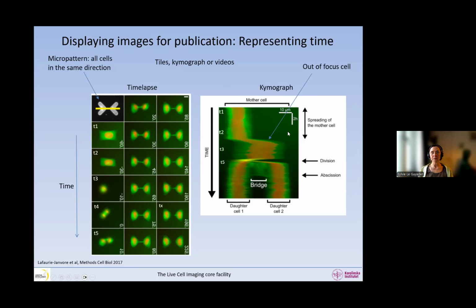And so we have lots and lots of images. We put them next to each other. And so in this dimension, it is time. And here it is X, the X dimension of the image. And so that works. And here you can see that the cell becomes a bit out of focus, because it's moving a lot when we go into this very fast phase in here. And then quite quickly, you can see here that we have a bridge that is being formed, and then we have two cells. So this kymograph is a nice way also, but it only works for some types of time lapses where you have a single object.